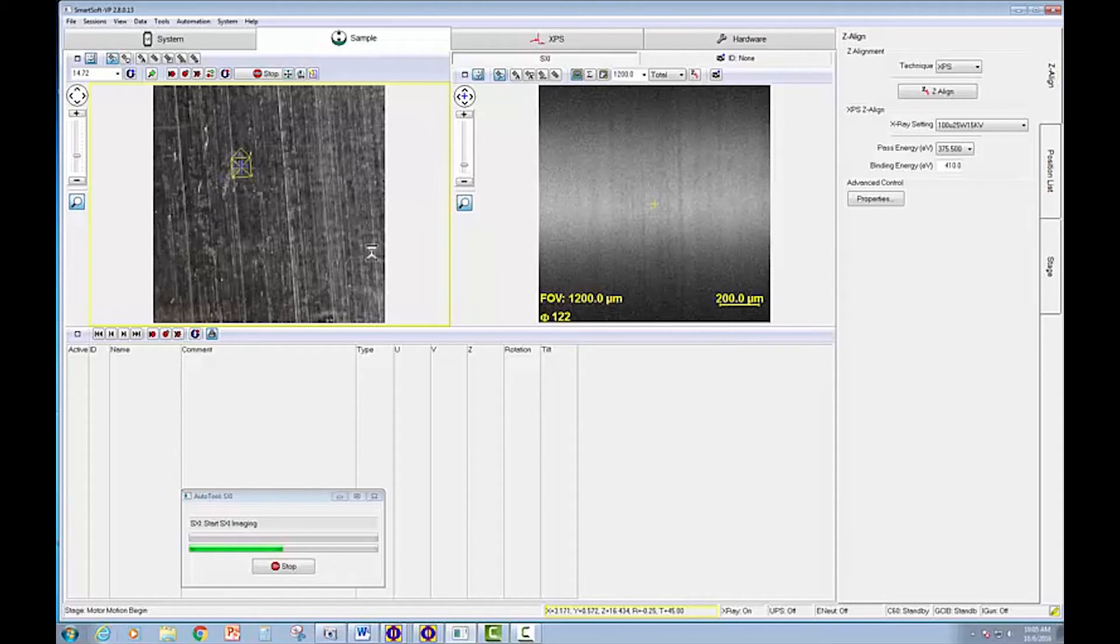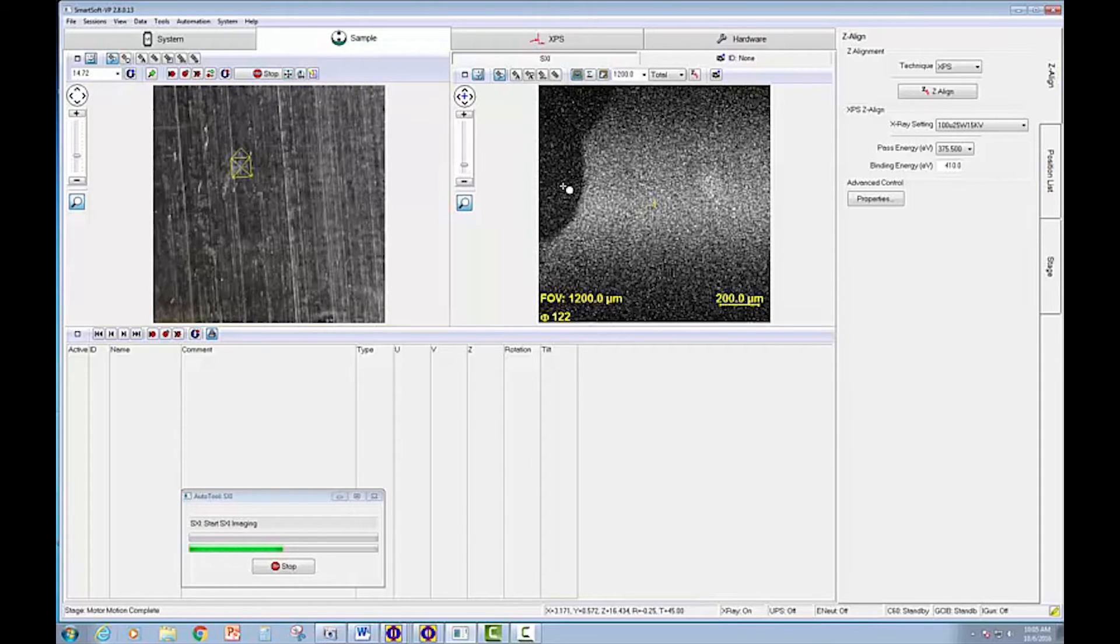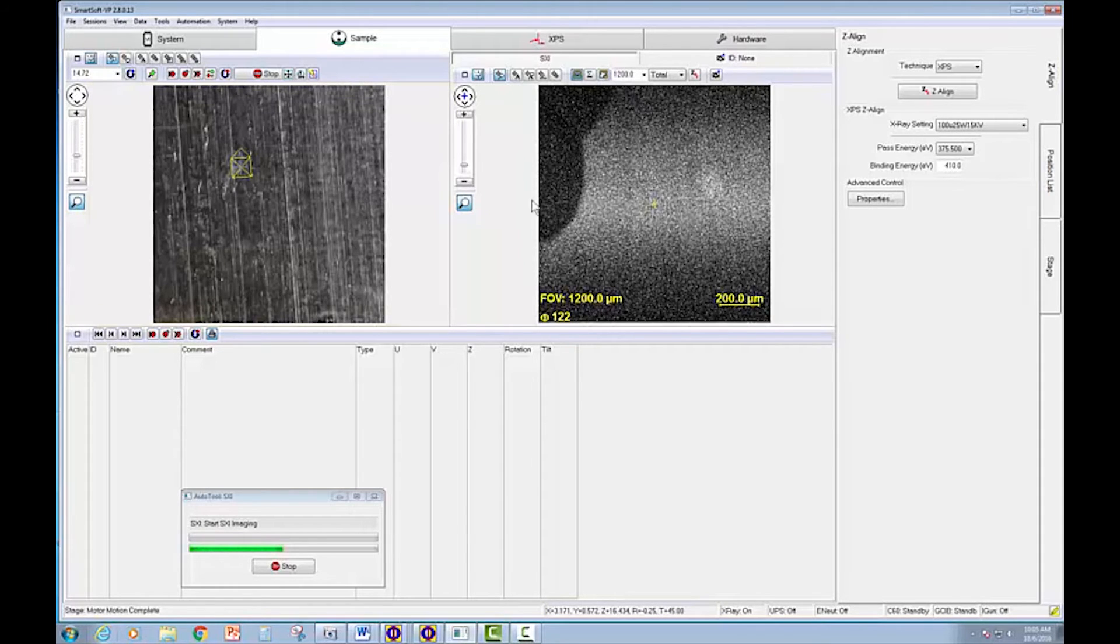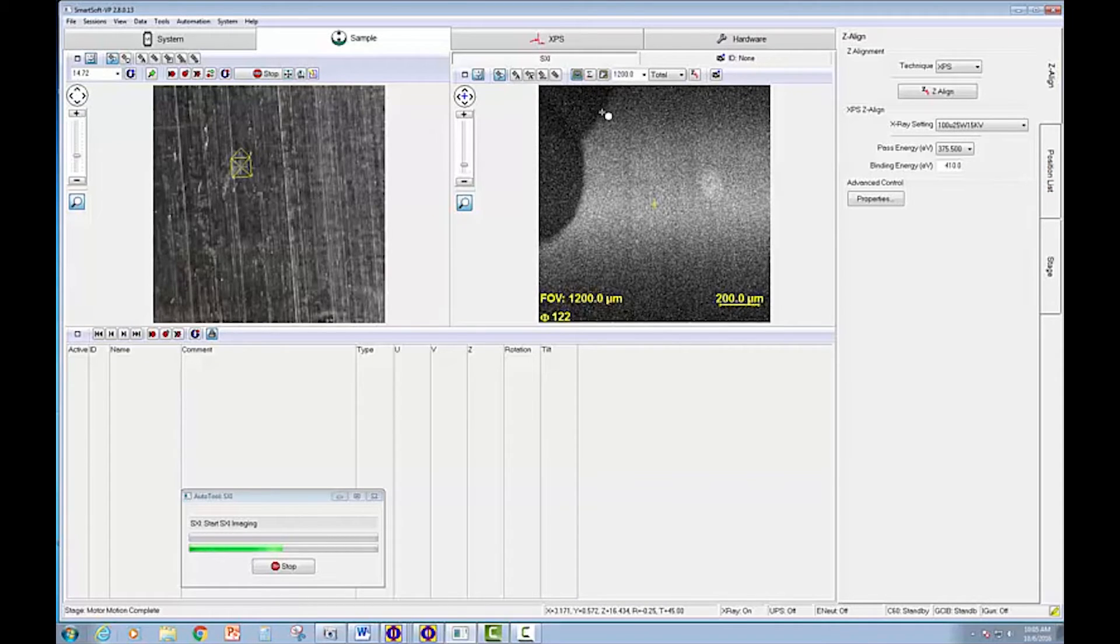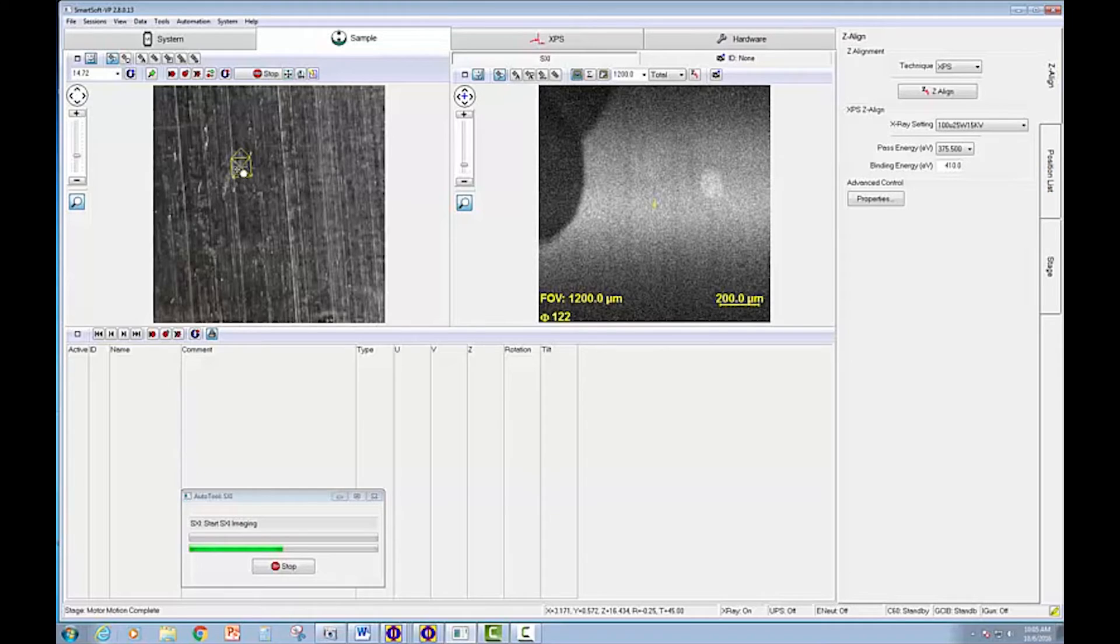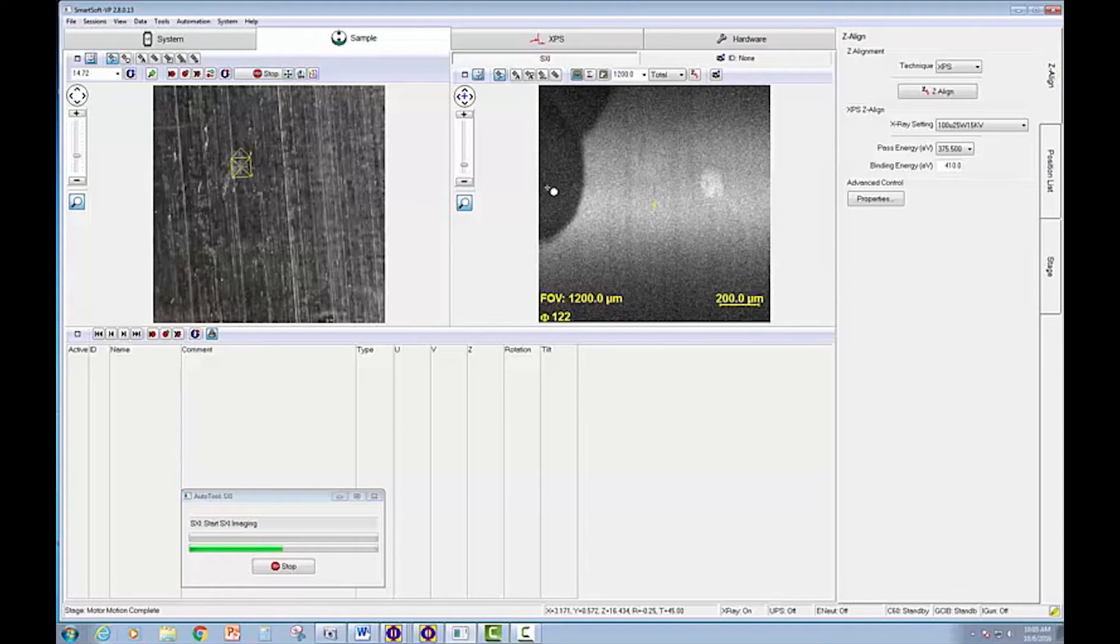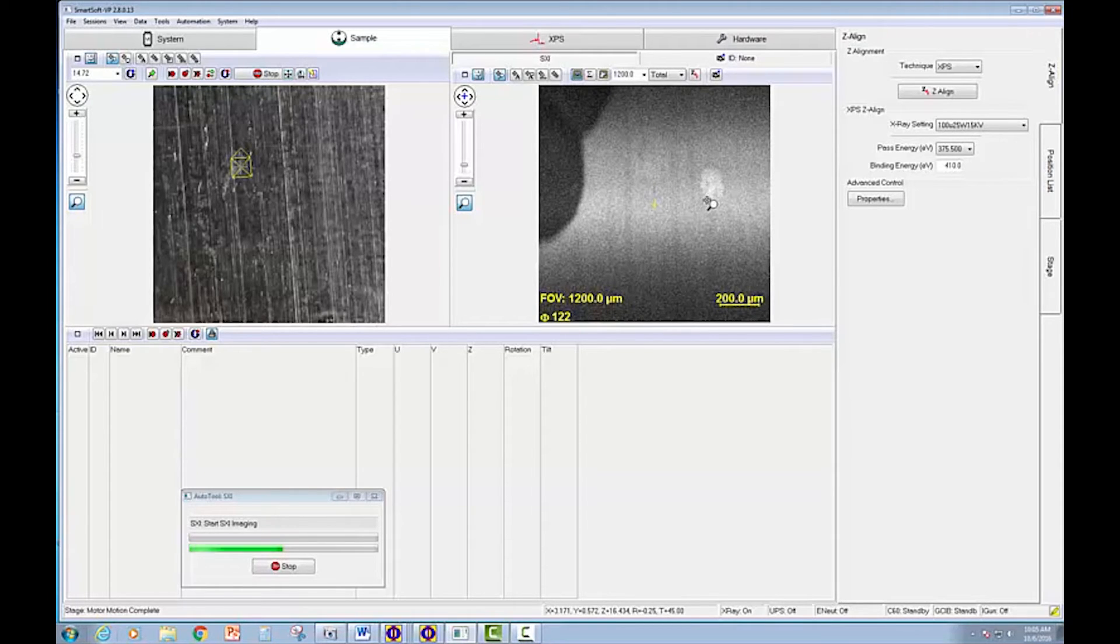And I'm going to refresh the SXI. And we can indeed see that there's multiple features visible at this time. We can see this area that's slightly whiter optically is producing significant contrast. And there's also a feature here that's not visible optically at all.